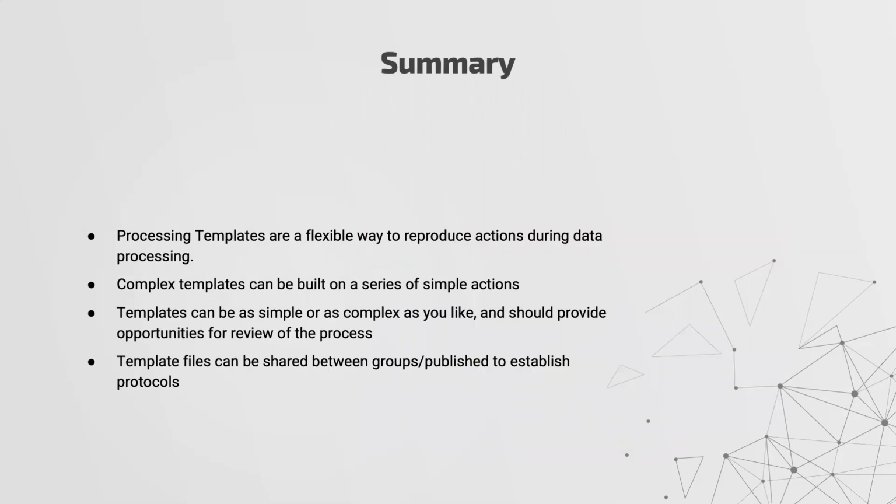All right, so to summarize, hopefully I've demonstrated that processing templates are quite flexible. You can do quite a lot of different things in them. Once you have them set up for your lab, they will do reproducible actions. You can build up more complex templates based on a series of simple actions. So you might start off simple just by creating selections, and then you add more complex things like moving selections based on criteria. And also, I should have mentioned at the start that template files are completely open.